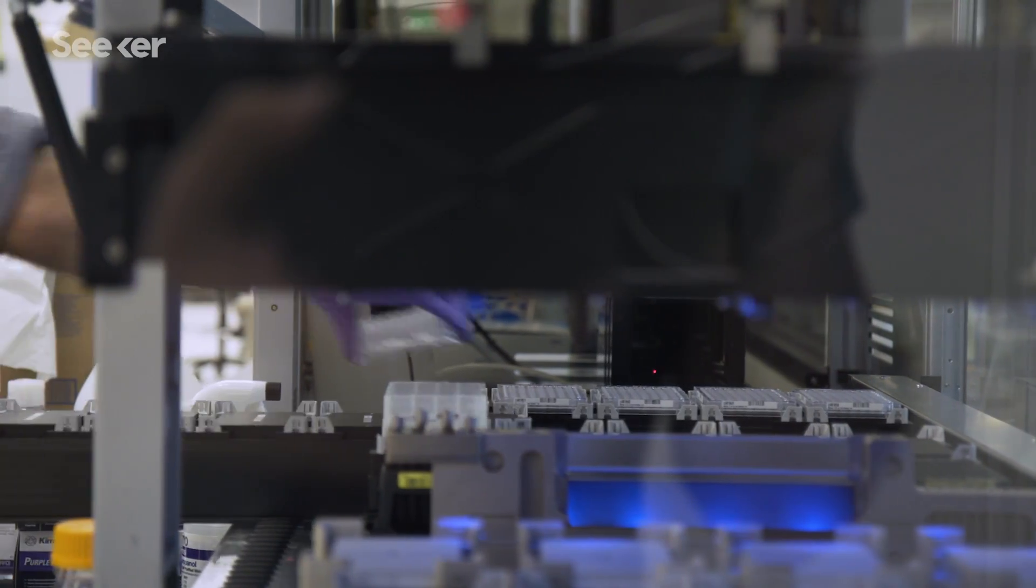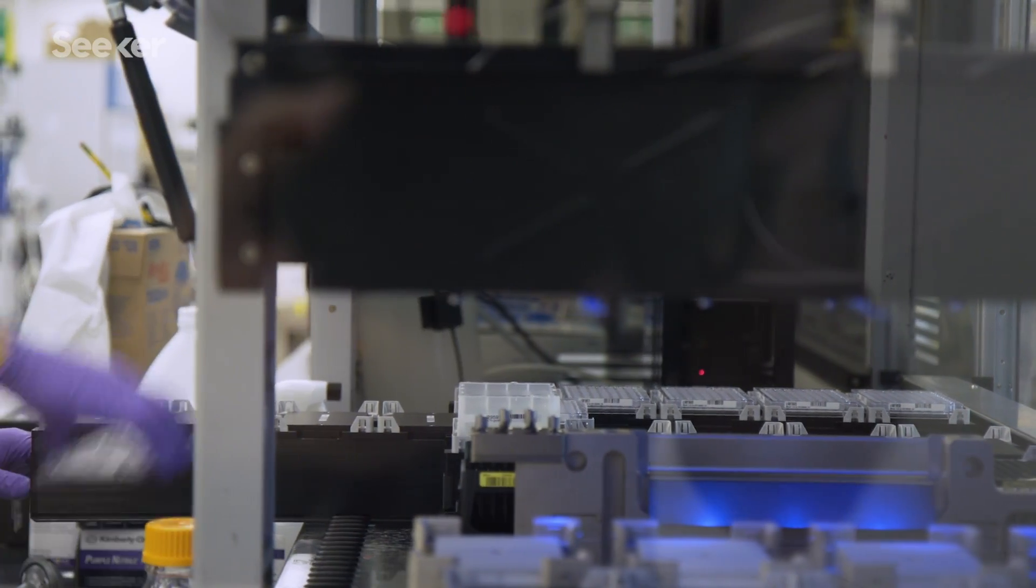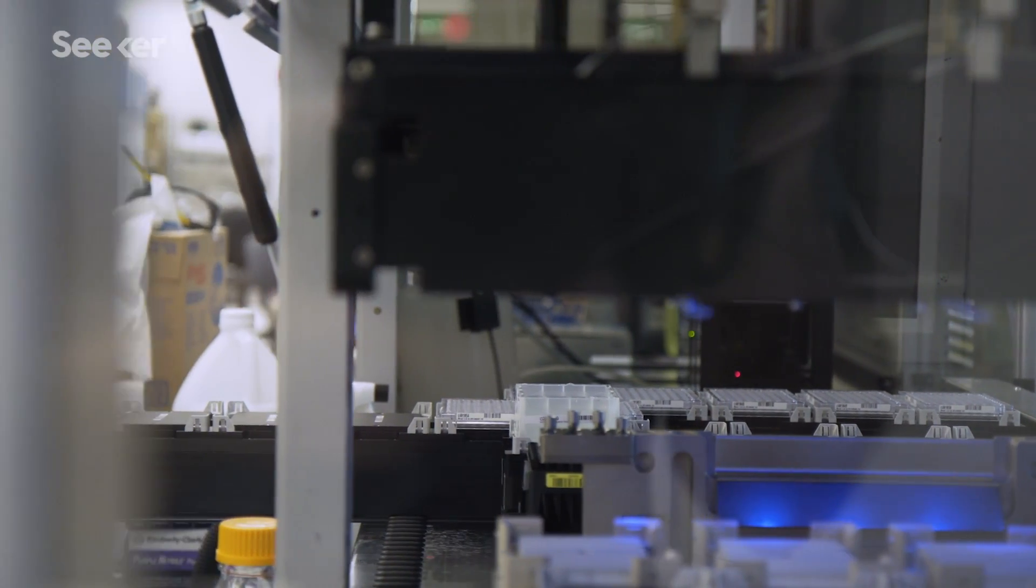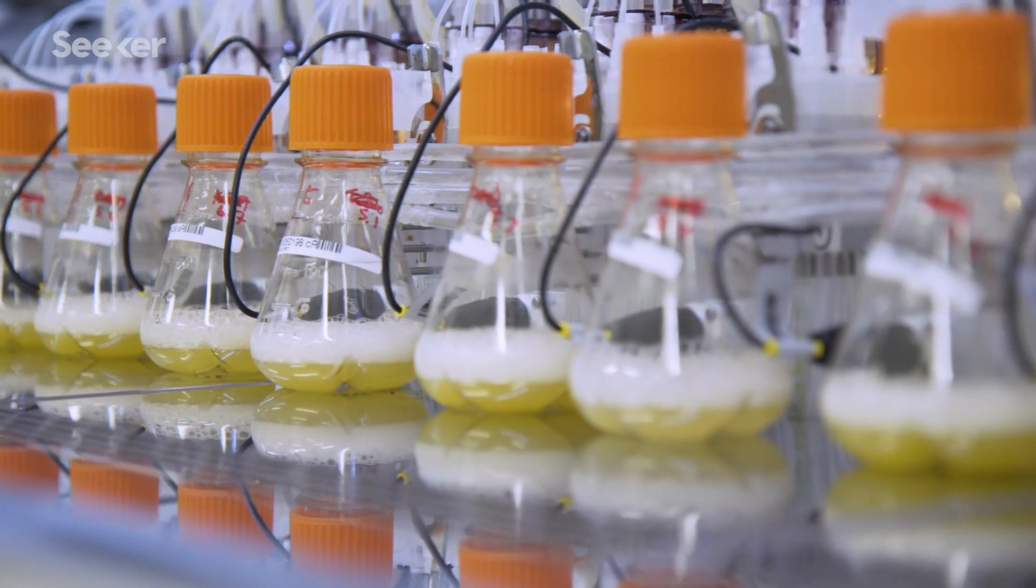But even with this operational efficiency and rapid prototyping, biology is still a messy science, and they're constantly going back to the drawing board. For me, this makes it really fun. A good experiment is something that tells you you were wrong, and that's a moment when you learn something new and when you change the plan.